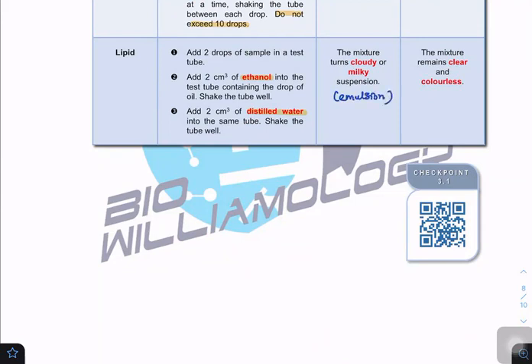Okay, so this emulsion basically is something like this. You've got this suspension, something like a powder. If you place a piece of paper with wording behind the test tube, you won't be able to read the contents. Okay? You won't be able to read the contents. So this one, consider that. It shows that lipids are actually present.